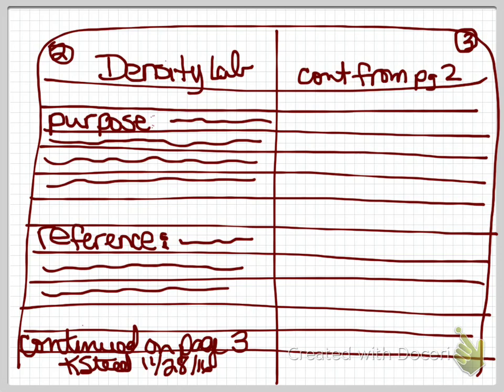And so they put, it would be like continued on page 7 or 12 or whatever, and then the next lab would be continued from page 14. So I'd have to go back and forth like that, because you cannot skip pages, and you have to go on to whatever page is the next available page. So we're good there.